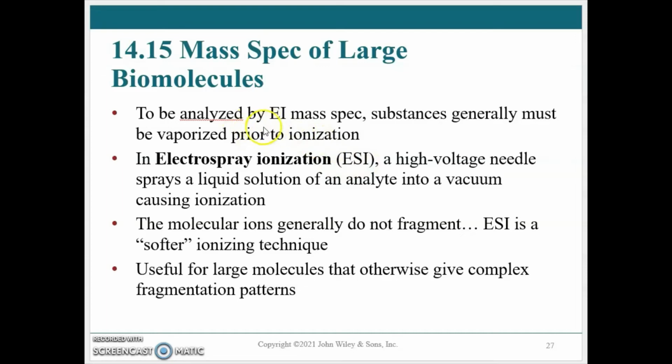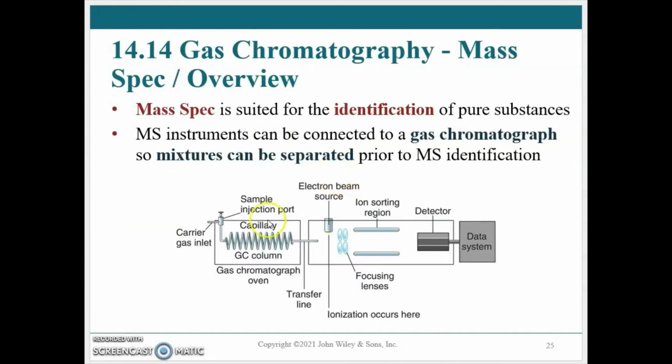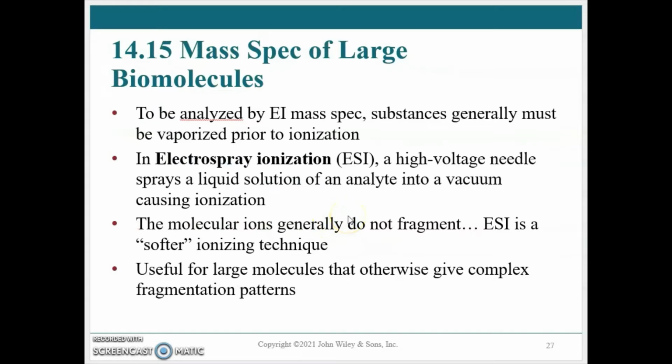But very commonly now, biomolecules like the GC experiment, but instead of GC, using a liquid chromatograph, a mixture of biomolecules, be it a blood sample, if you're doing monitoring of metabolites in a patient in a clinical trial, a blood sample typically would undergo some kind of fractionation before it's injected. But the biomolecules will be separated chromatographically and then through electrospray ionization enter into the mass spec, and you can collect a mass spectrum of the individual components of a mixture that way.